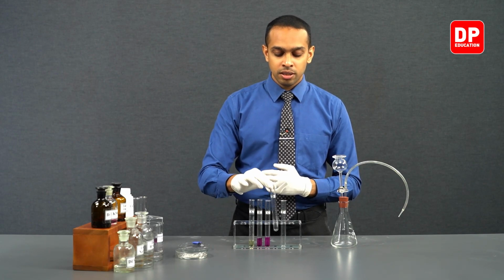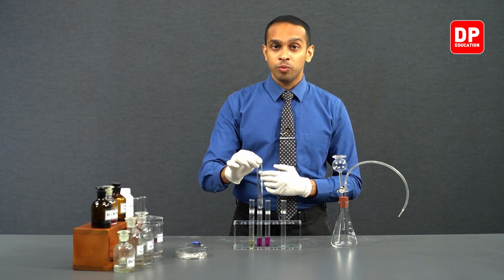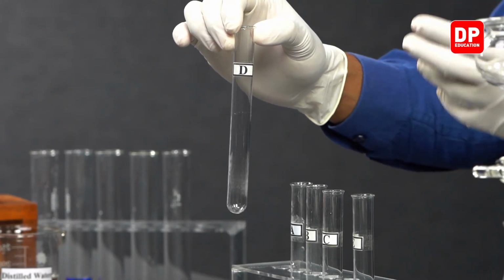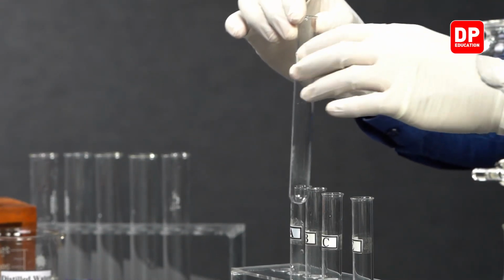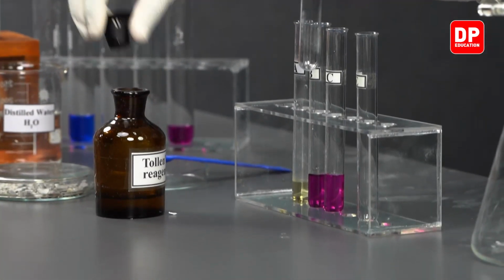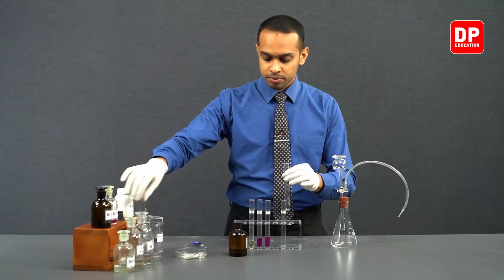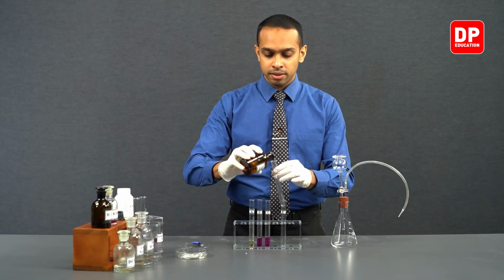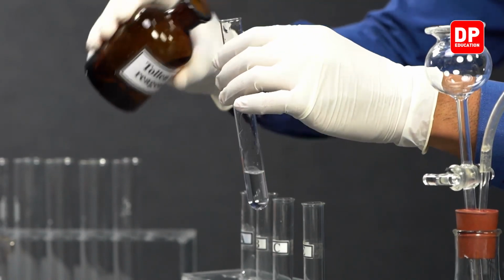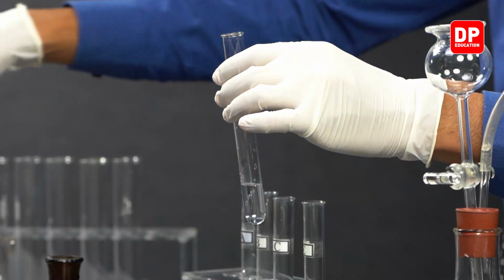And then to test tube D, we are going to be adding Tollens reagent, or in other words, ammoniacal silver nitrate. So we have ammoniacal silver nitrate. Let's add a small amount of ammoniacal silver nitrate into our test tube here.